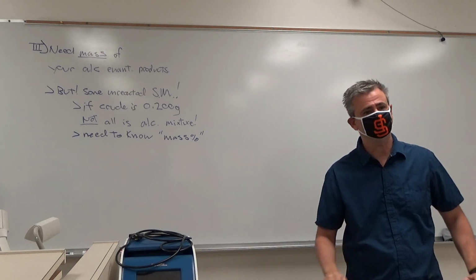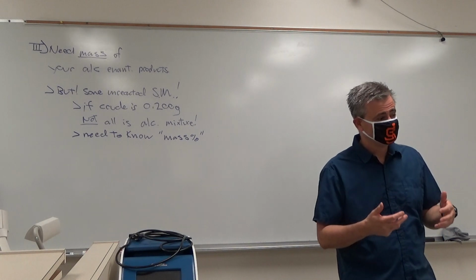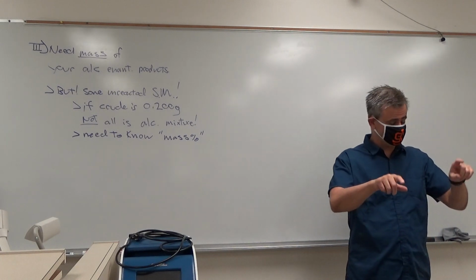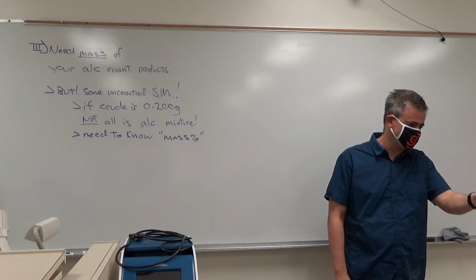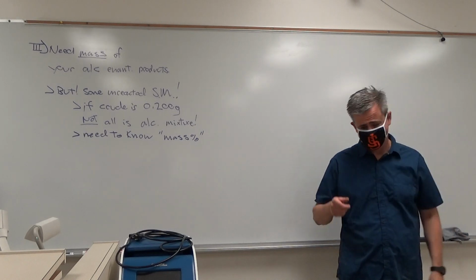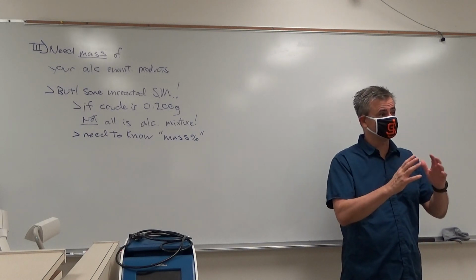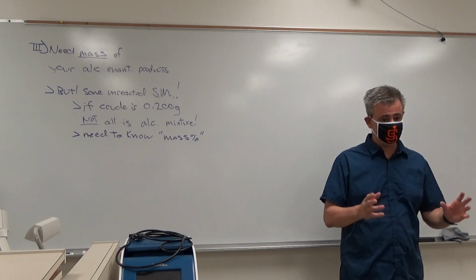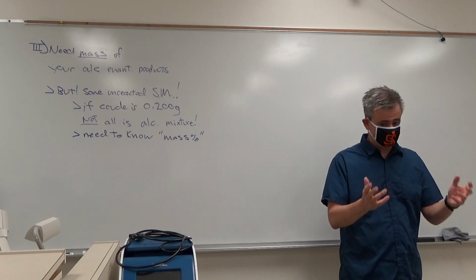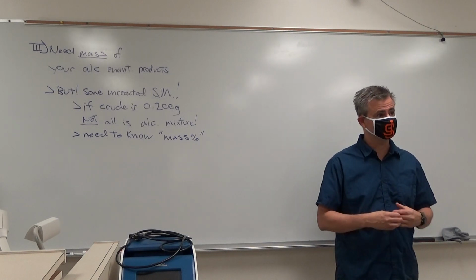No. Almost. NMR, if you compare the signals, you got to pick a signal on each molecule. Okay, I know that signal is from the ethyl, the starting material. I know that signal is from the product, and compare the integrations. Oh, 50-50 integration. Oh, no, this one, if I add up the total value and then figure out this one is 80% and this is 20%. Okay?